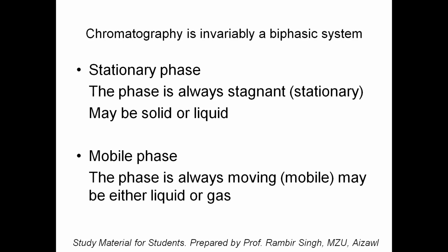So what we do actually in supercritical fluid extraction, we take a gas, we liquefy it, convert it into a fluid, and then do extraction as well as chromatography, right? The advantage is, suppose I want to extract something of food grade. In the market there is one product you might have heard about, called decaffeinated coffee. Have you heard of it? Yes, sir.